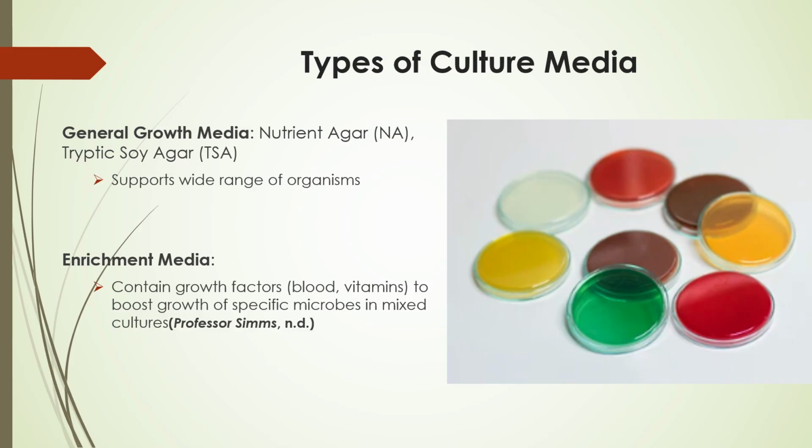Enrichment media, on the other hand, are made to promote the growth of particular organisms, particularly when those organisms are present in small quantities in a mixed culture. They have extra ingredients like vitamins, blood, or other growth agents, as I mentioned before. Enrichment media are particularly helpful in clinical or environmental microbiology because of these ingredients, which aid in the growth of fastidious microorganisms.